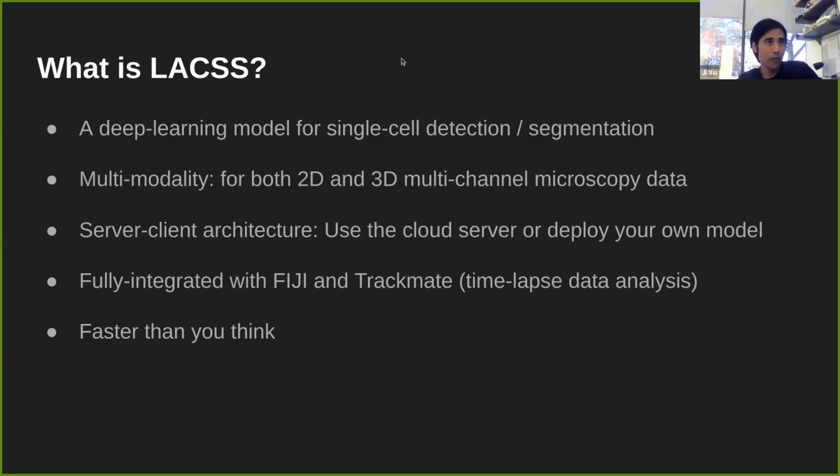Or you can deploy your own server if you have a large amount of data to process or a lot of users. You can set up a Linux machine, run a few command line codes, and have your own server deployed. You can even fine-tune the model to whatever data you're interested in and deploy a custom model.